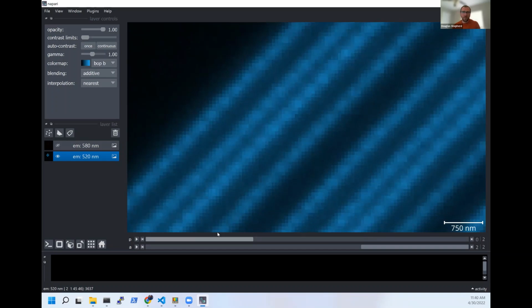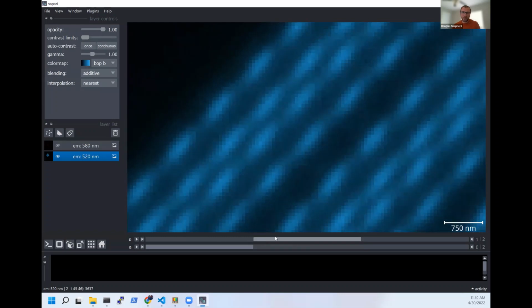And so this is really important in raw SIM data, that you actually can detect these if you're working at SIM frequencies that are inside the detectable limit of the system. TIRF-SIM or other methods have exceptions to this rule, and they require special care. Those are not really data sets that our package is suitable for reconstructing at the moment, without a lot of guesswork, because we're not really using that modality.